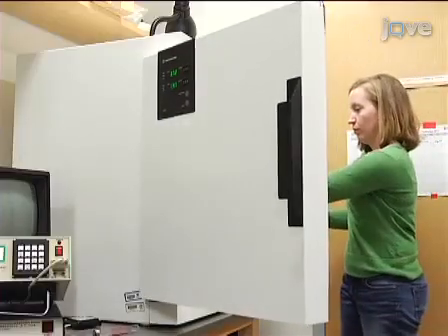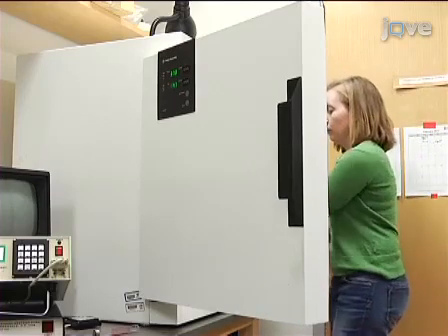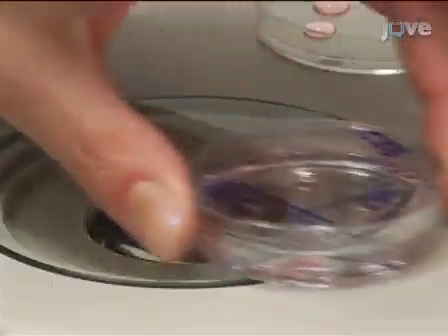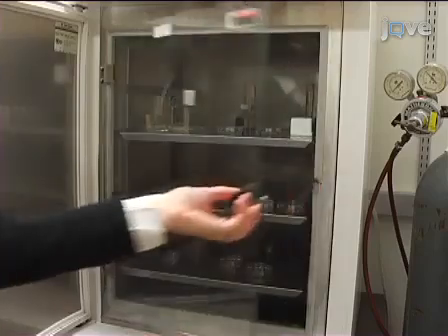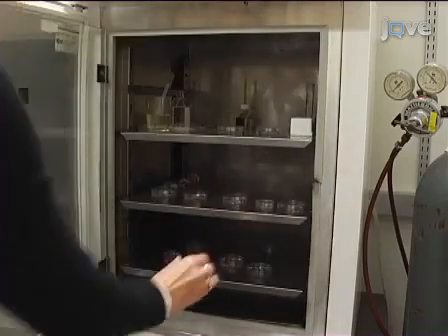Once all the oocytes are injected, return them to the incubator to hold in culture medium for the desired time, which typically ranges from 12 to 24 hours. Then wash the oocytes through several drops of CZB and transfer to a microdrop of CZB under oil and incubate for 16 hours to complete maturation to metaphase of meiosis II.